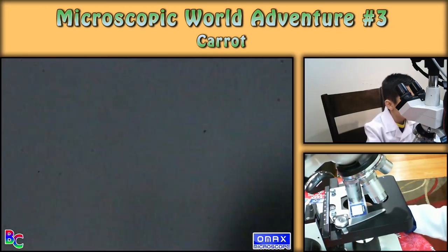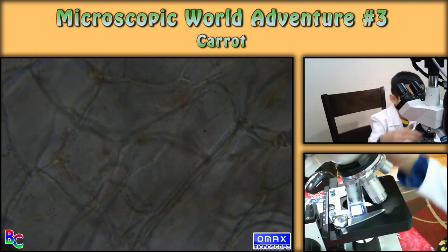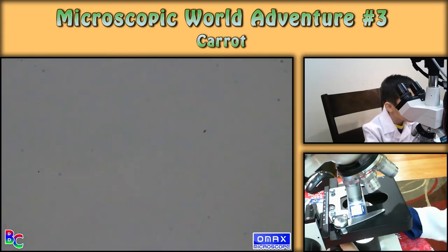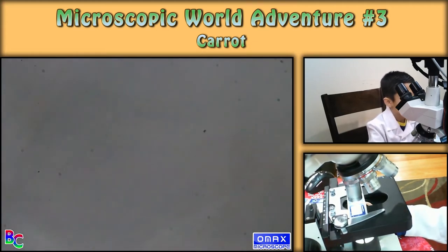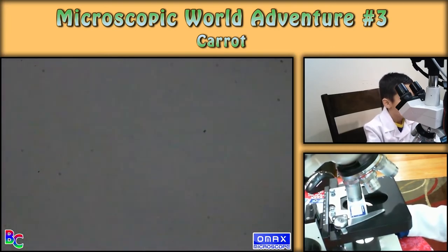You see those lines? Those are epic! Just look at those. Whoa, focus! I'm focusing on a circle — I don't know why.